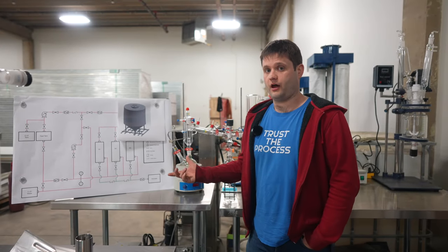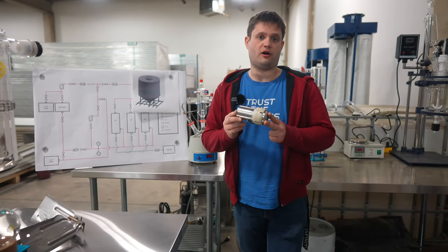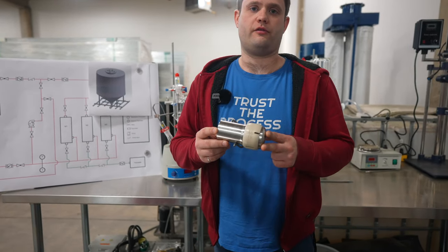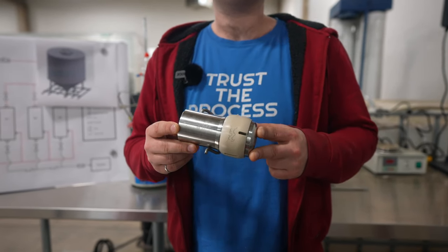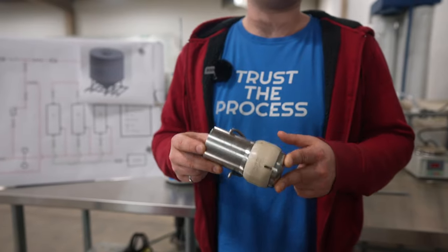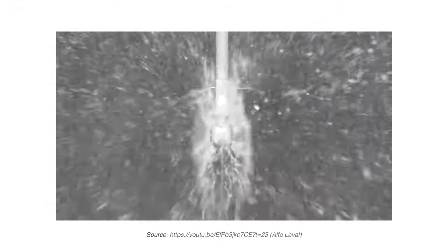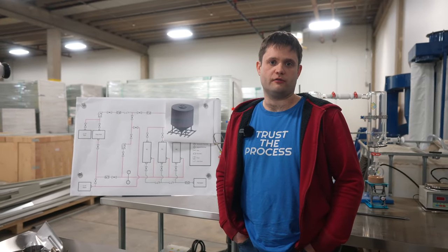Once all the slurry has been evacuated from the vessel, a water attachment will spray through a spray ball like this. This will ensure that no biomass remains in the tank, and that the tank comes out clean — no solvent, no biomass — ready to be filled again if the filled material is from the same batch. If it is from a different batch, there will of course be a terminal cleaning process. This design allows fully continuous operation while having no concern of contamination between product batches or lots.